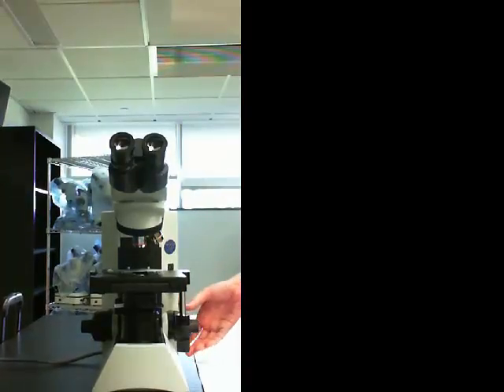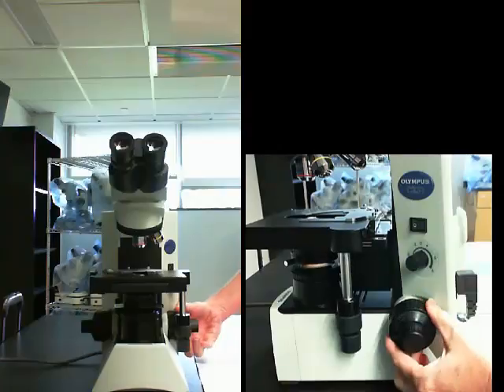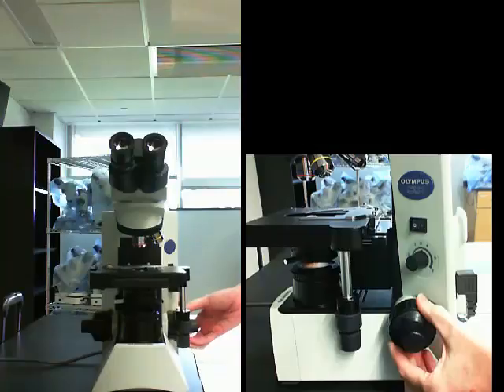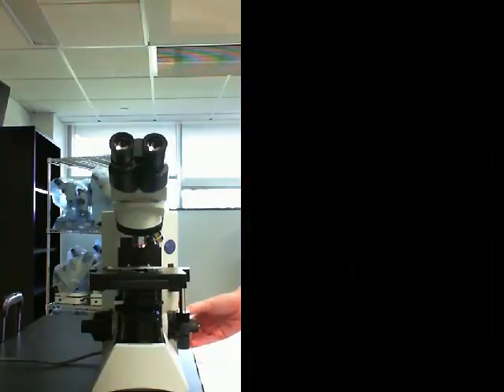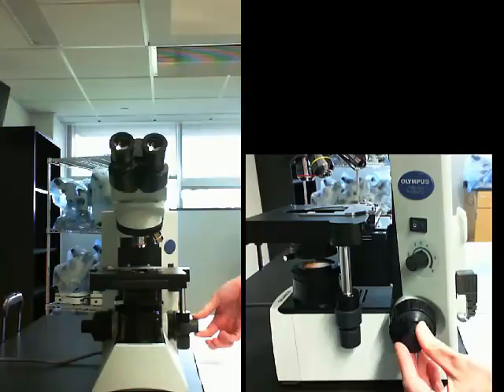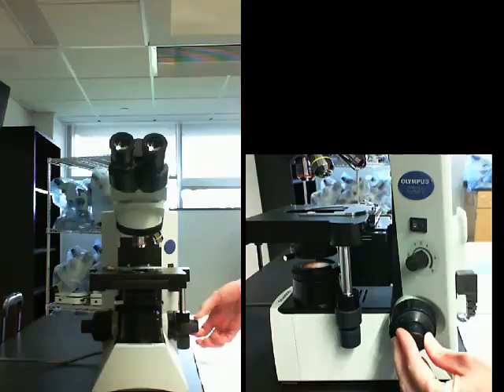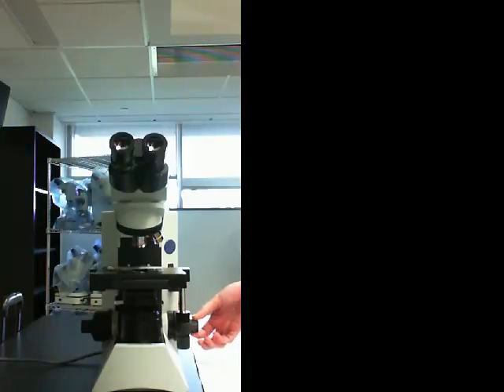We then have our adjustment knobs for focus. The larger of the knobs is the Coarse Adjustment knob. You're going to use this when you're focusing either on the scanning objective, which I'll point out in just a moment, and sometimes possibly to tweak the low power objective view. Embedded within this is the smaller knob, which is our fine adjustment knob, and this is for precise focusing once you've done your coarse focusing on scanning or low power. Once you get to the high power objective or the oil immersion objective, you are only going to use the fine adjustment knob.